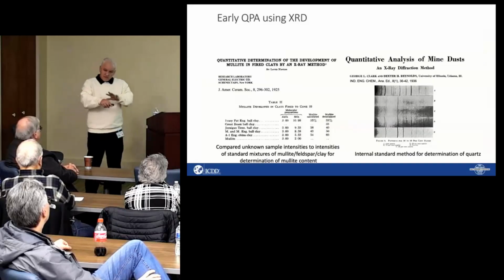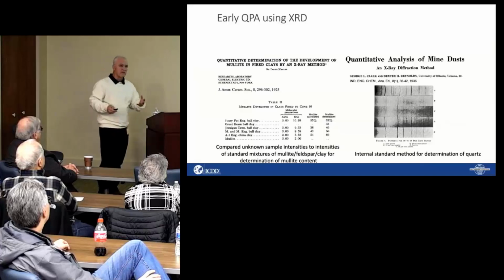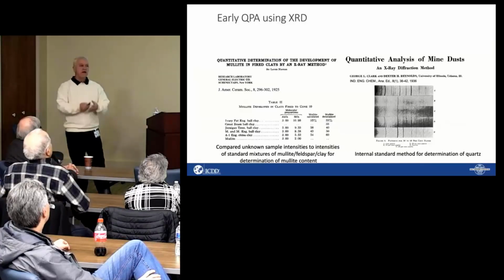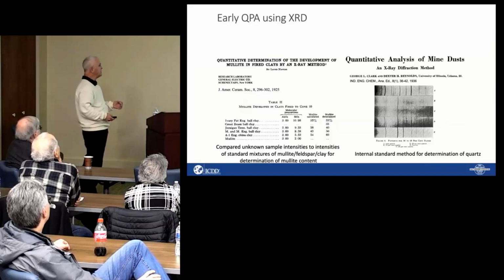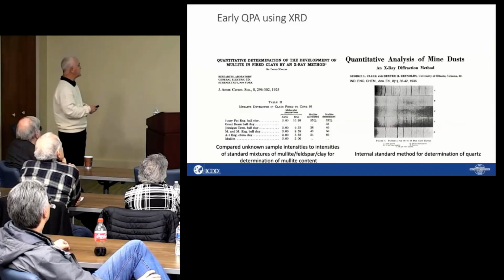Now, we have the qualitative aspect of it, and a lot of times someone will come in for the powder analysis and say, can you tell me what I have? And you do that. And then after you've done that, they say, well, can you tell me how much? Okay, and the how much is often the more difficult consideration because of some of the issues with powder data.